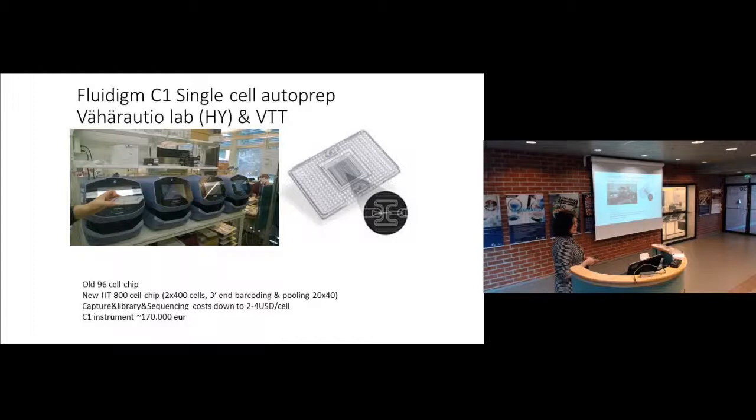This Fluidigm C1 was the first one in the market. Now I think the VTT group has this machine, and also in Anna Vähärautio's lab in Biomedicine we have one. So it has been in the market for a couple of years now, a bit more I think.